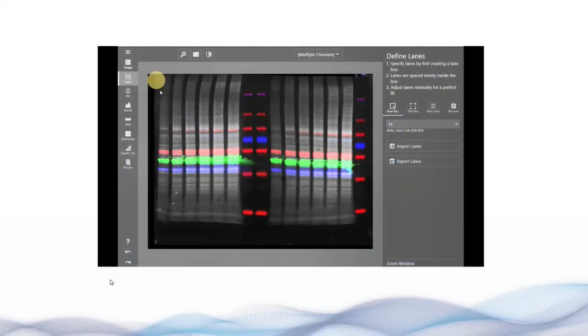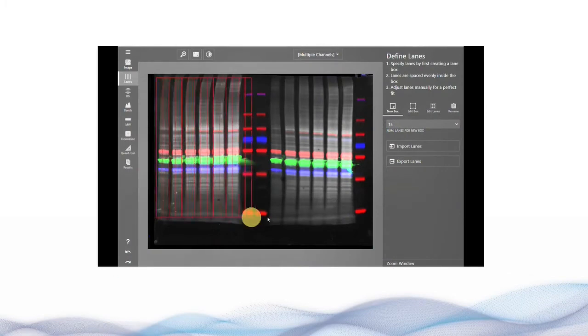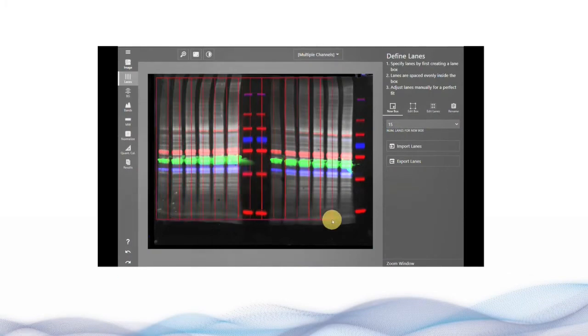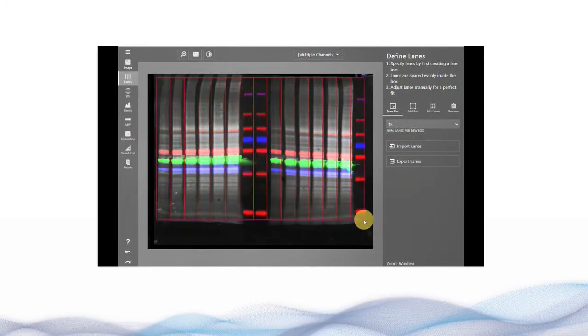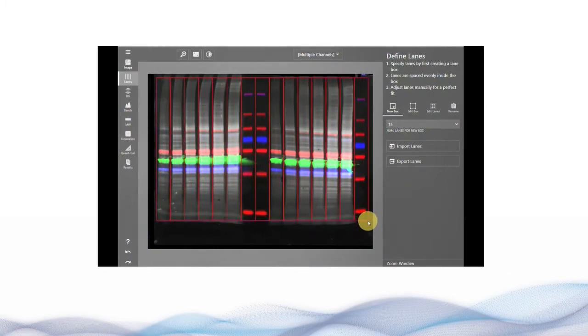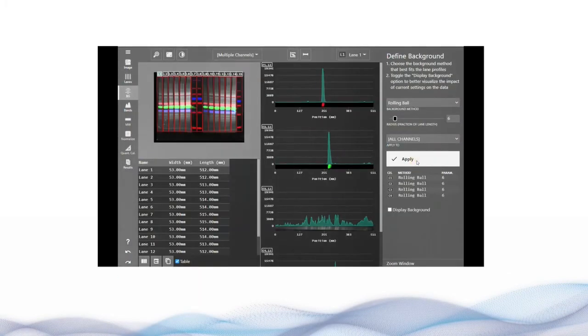In this video we will be using a multiplex western blot in order to cover normalization and quantity calibration.